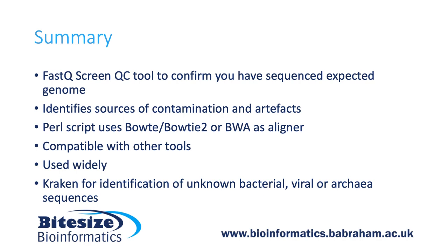As I mentioned before, it's compatible with other tools such as Bismark, so you can perform QC on bisulfite datasets. And if you're analysing a large number of datasets in one go, then FastQ Screen is compatible with MultiQC, which is a good way to collate the results from large numbers of samples in a nice, simple and easy to read output format.